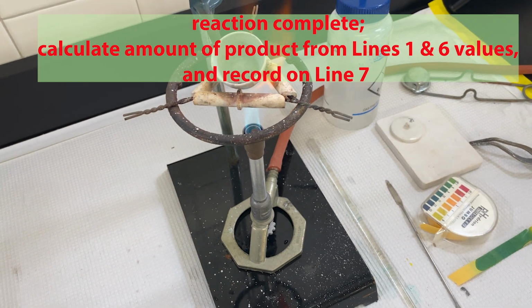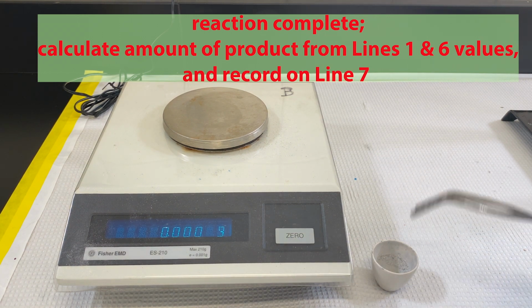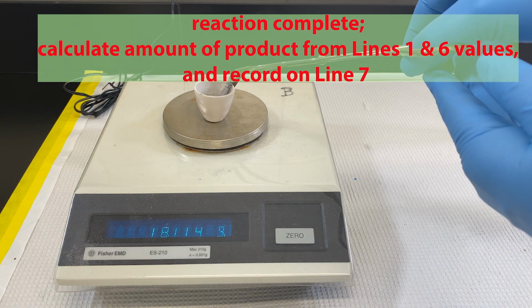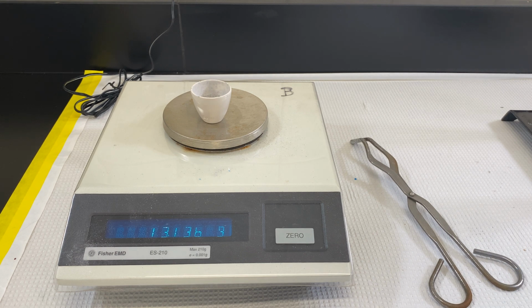until once again we have our solid product formed. All that remains now, before we do our calculations, is to determine the total amount of product that was formed. An easy calculation. We have but to subtract the weight of the crucible from the total weight of the crucible plus product.